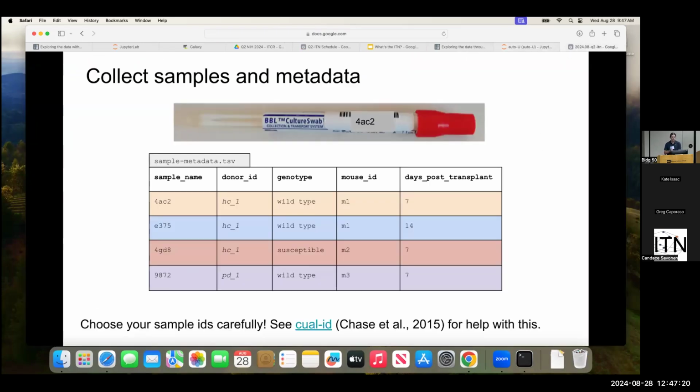Okay. So I just want to really briefly work through what some of the files are that we've dealt with already, and just contextualize that for what we're going to be doing in the next stages. I realize a lot of this, people have some experience with, know about this already, but I just want to use this as an opportunity to get our language consistent, get on the same page. And so generally a microbiome study is going to start with going out into the world and collecting some samples.